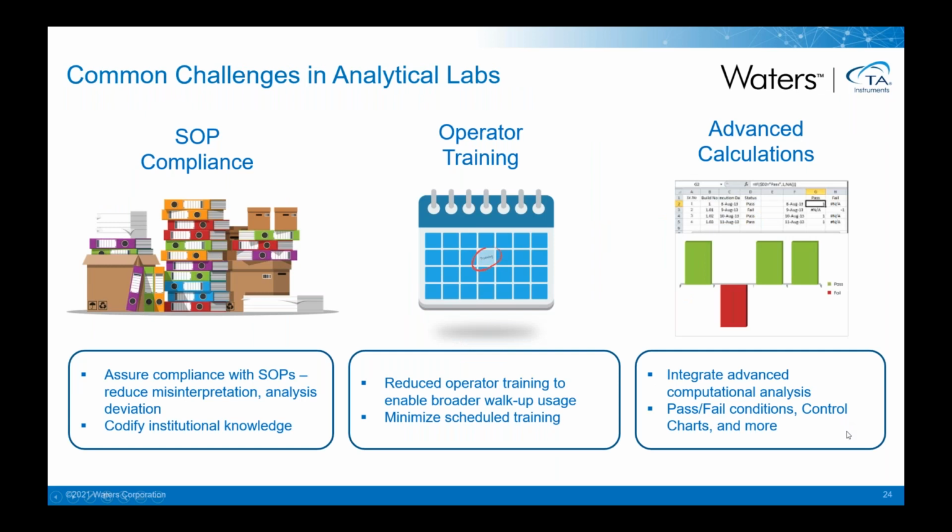If you look at the common challenges within analytical labs, maintaining operating procedure compliance, making sure that we're going through the same steps between operators, between days, between various instances, making sure that all of that is compliant is critical.